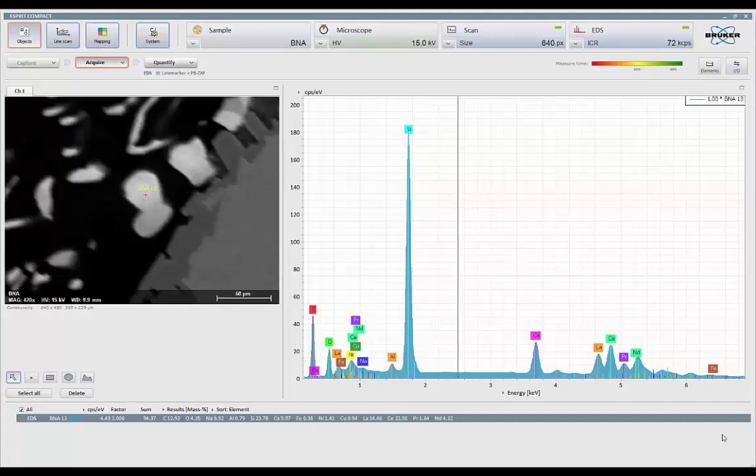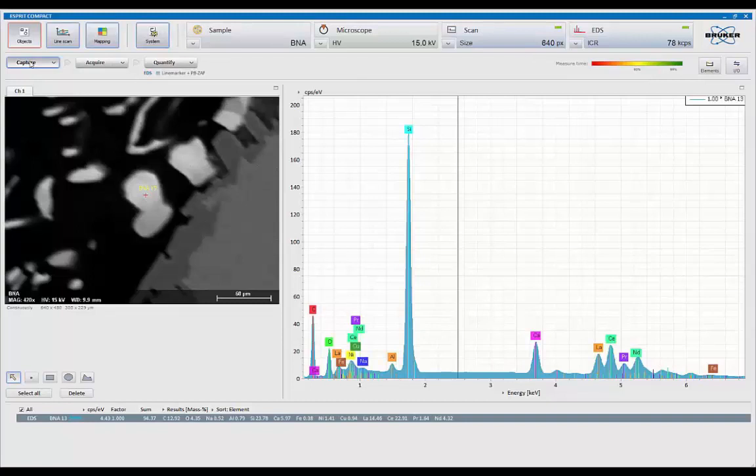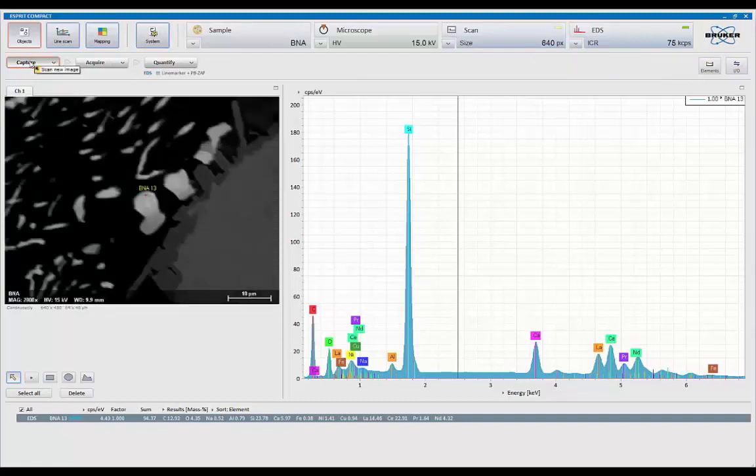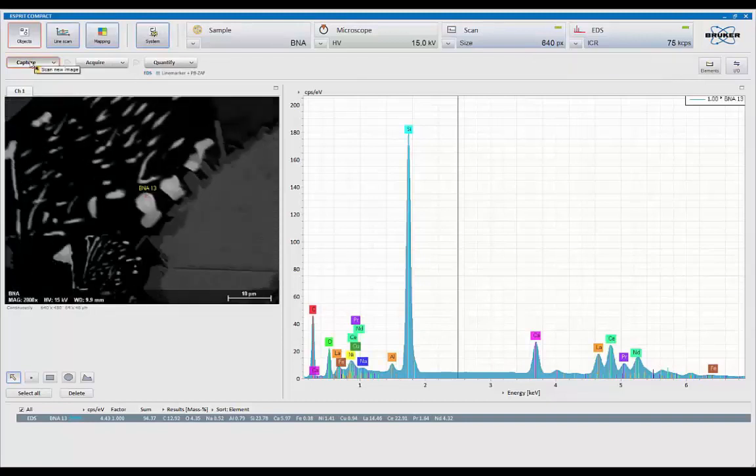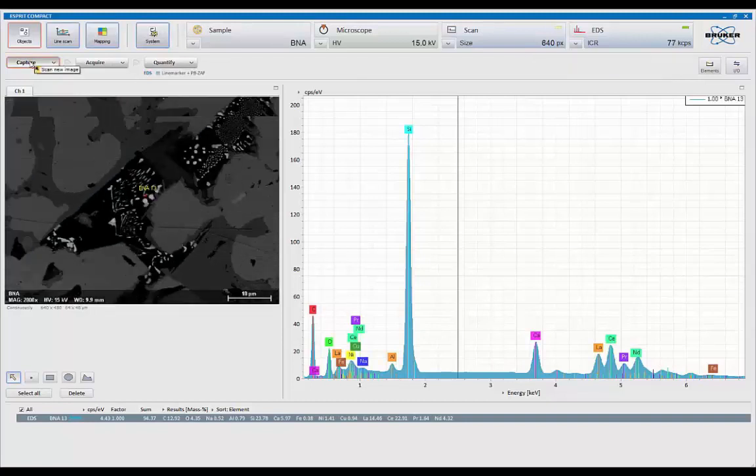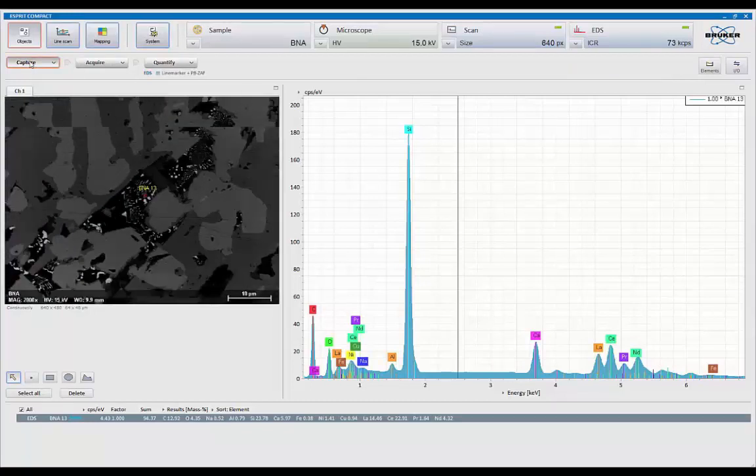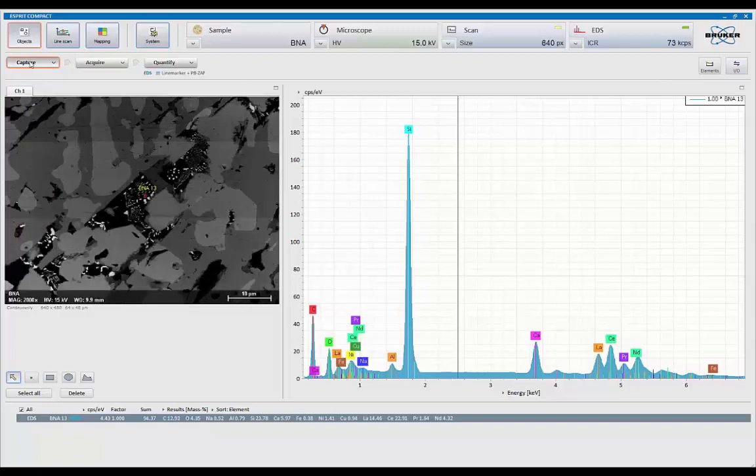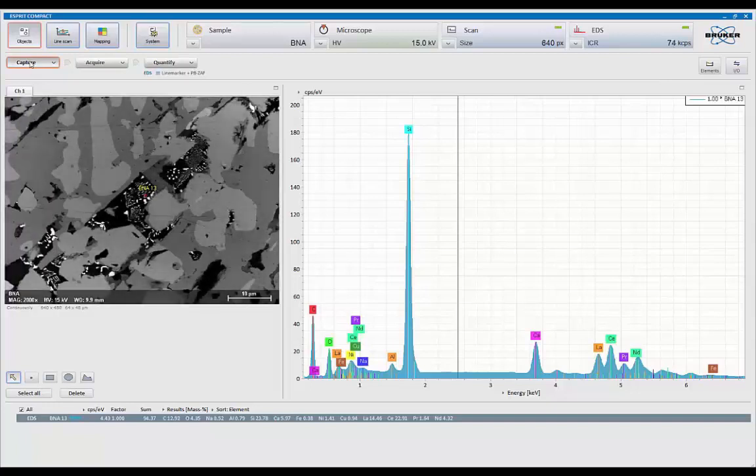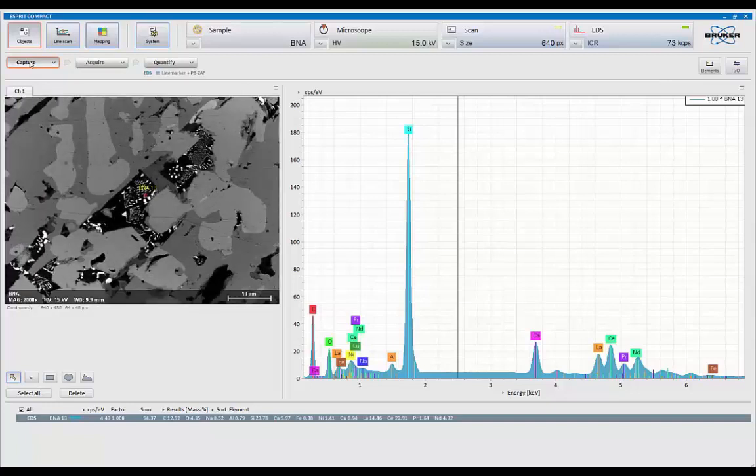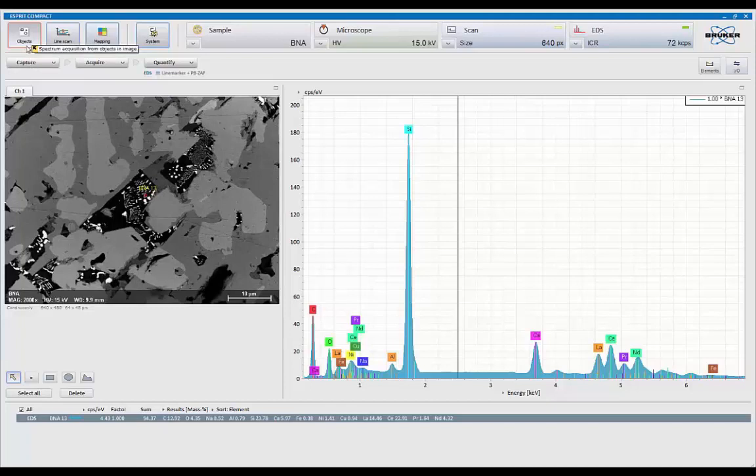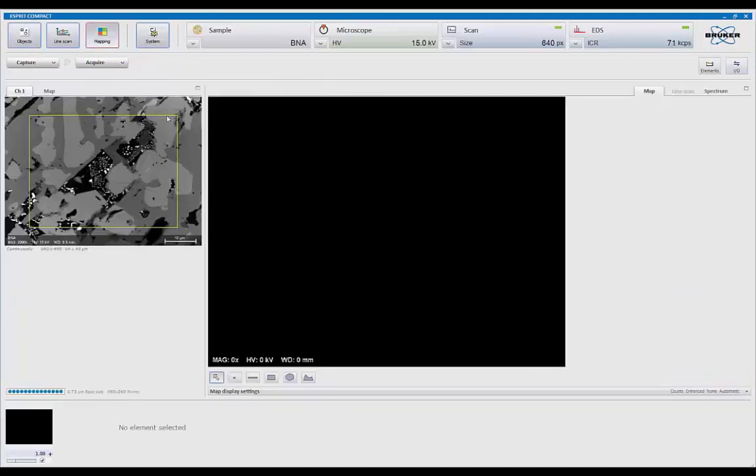The ultimate analysis most people would like to do is to map and show chemical distribution or change, or what we commonly call x-ray mapping, on the system. So again, utilizing the same area here, we're going to switch from object mode over to mapping mode.